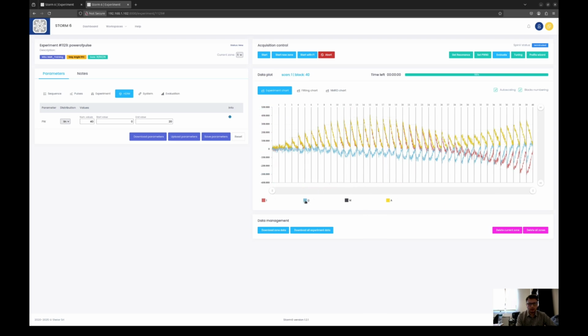Okay, so we have our angle experiment. To be sure, we have to see, okay, as you can see we have this 180-degree crossing, so the real part starts from positive and then goes to negative. So we can say the angle experiment is okay, and we are quite happy with what we got. The next step is to know the value which the experiment has calculated, and we can get this from here. We just have to press set PW90.